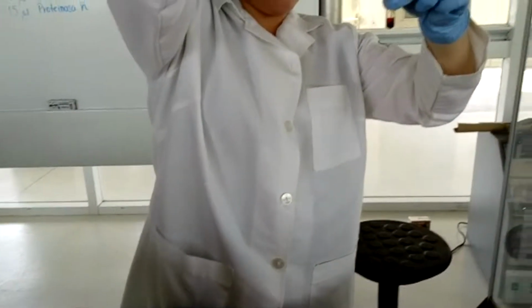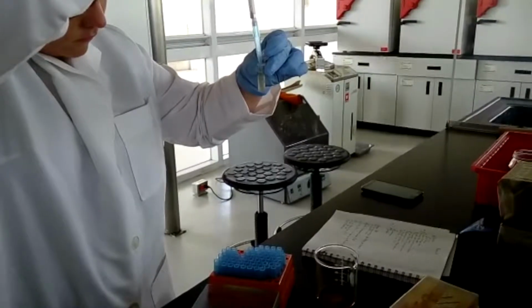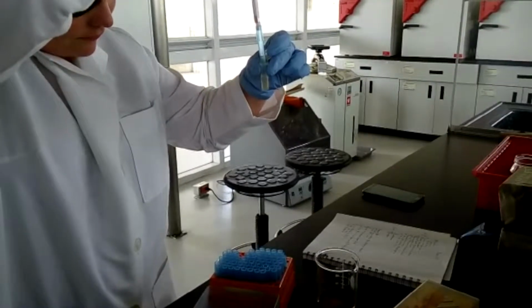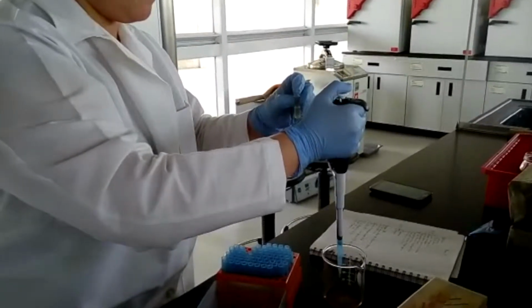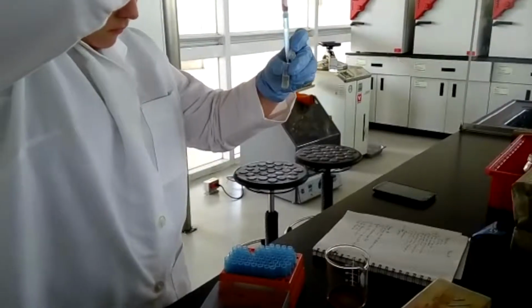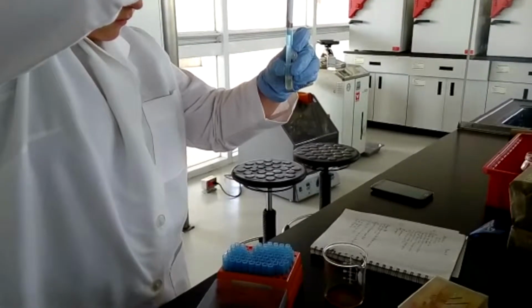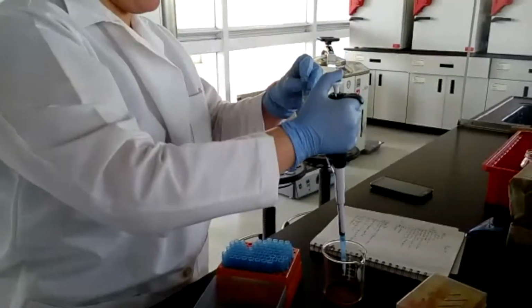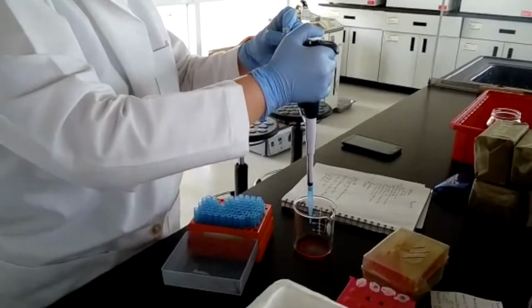Column chromatography has proven to be a very useful tool because it has several mechanisms of separation. The modification of the different existing stationary phases, as well as the development of new ones, is the main basis of obtaining the necessary conditions for the rapid and efficient separation of biomolecules. These modifications or different ways of using column chromatography made this a very adaptable and flexible process. Some of these are permeation chromatography, ion exchange chromatography, and adsorption chromatography.